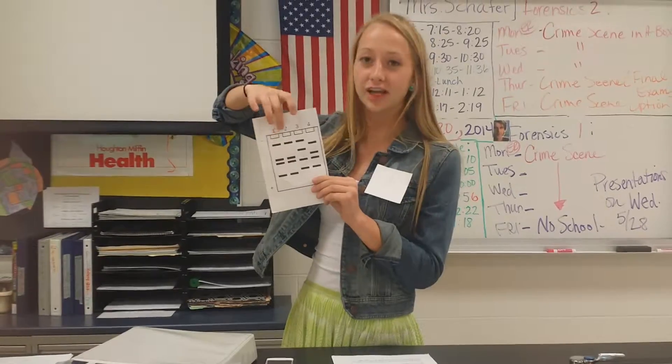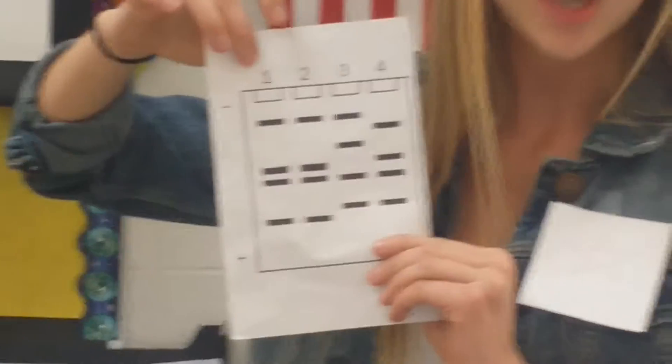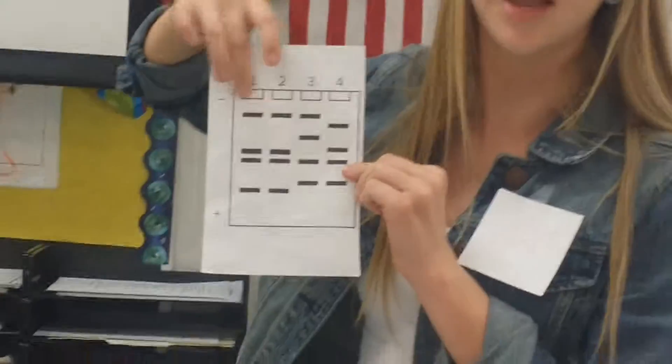Annie Starr talking about gel electrophoresis. In gel electrophoresis, DNA samples are loaded into the little containers here at the top of our little gel box. A current is run through the gel, causing the shorter bands of DNA to go to the bottom, and the longer bands up here to stay at the top.